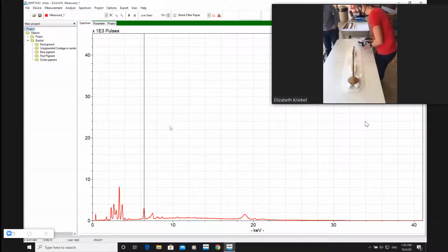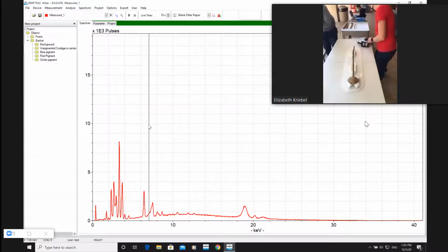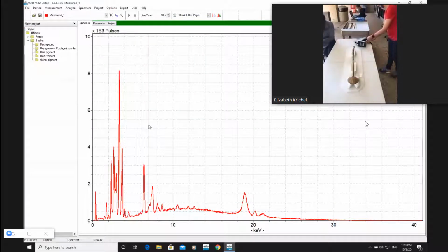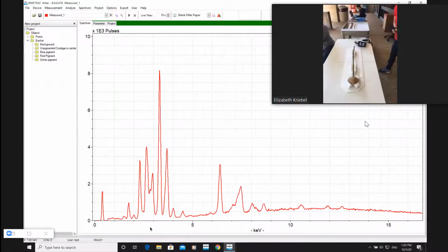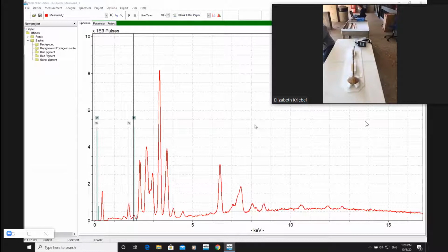All right, so let's take a moment and see what we have here. So you see a lot of elements here. I'm going to start from beginning to end. The first thing we see here, that's right there, is some silicon. The silicon is coming from dirt over time, which is packed in there. So there's a fair bit of dust and all that. I also see some phosphorus, which tells me right away that there's animal. This is a leather, right? Yeah, we're looking at leather wrapped around the branch, right?